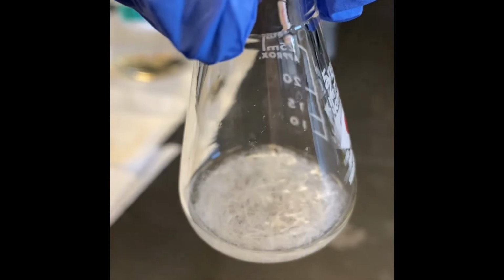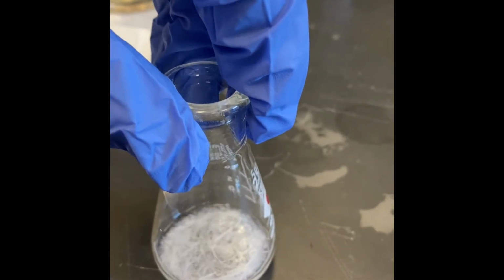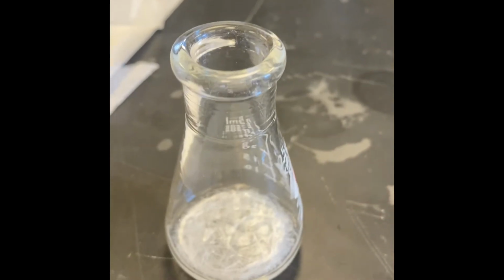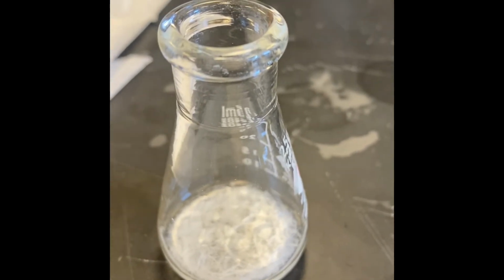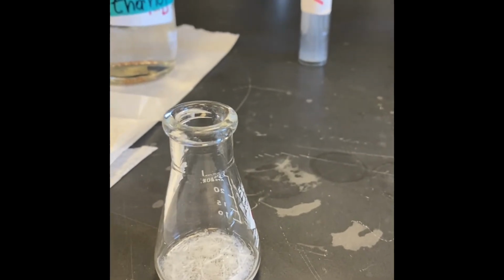Okay? So I don't want to disturb too much. So you can see the crystals forming. It's dancing actually, kind of crystals. So you can see it moving around, right? Yeah, okay. So we'll wait for some more time and then we filter this.